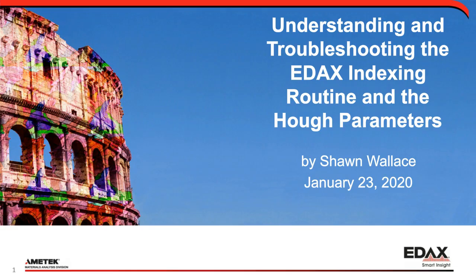So, with that in mind, again, our topic today is going to be understanding and troubleshooting the EDAX indexing routine and the Hough parameters. The reason I chose this topic is I think it's really important to understand what's going on behind the scenes to fully understand your data, the quality of your data, and of course, in the end, to get better data for yourself.